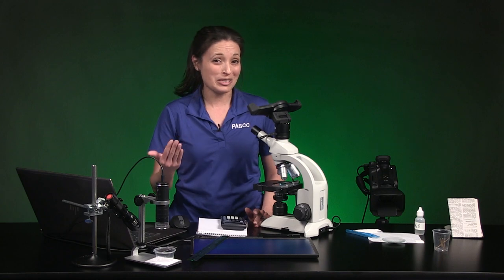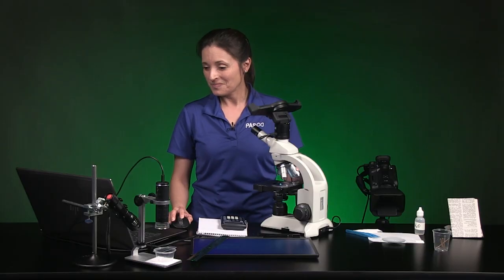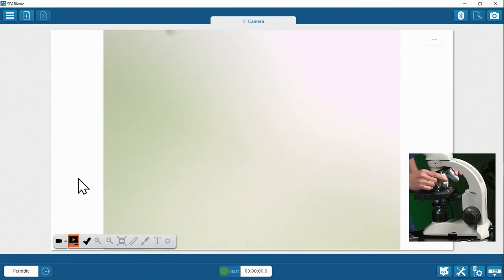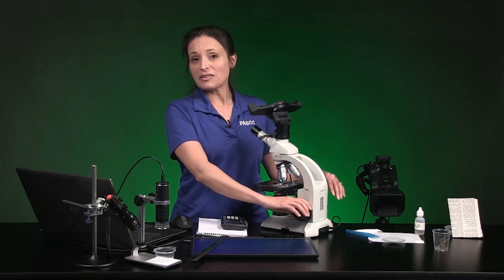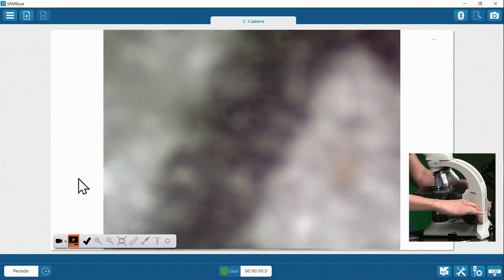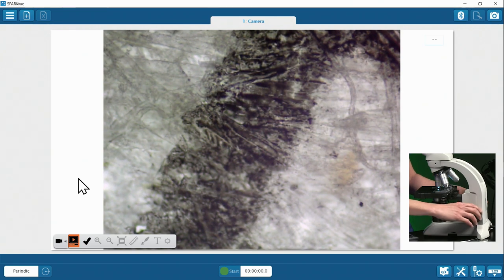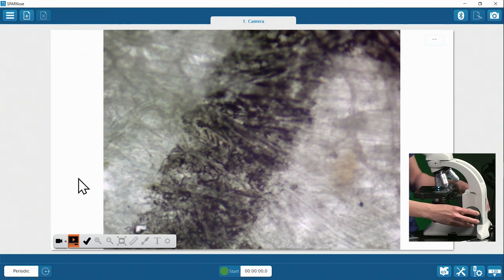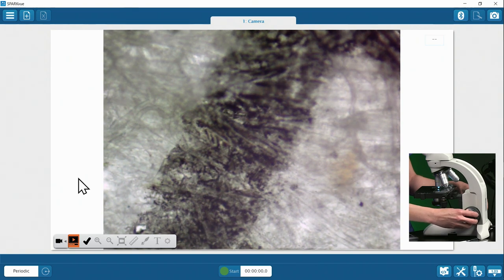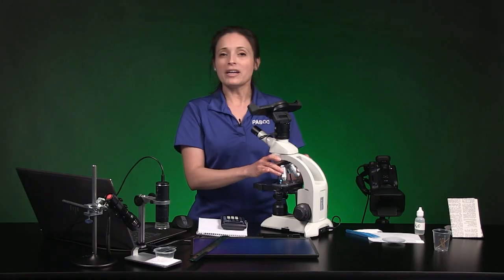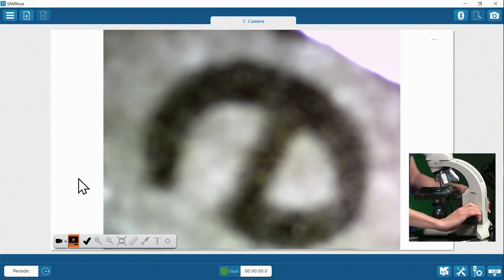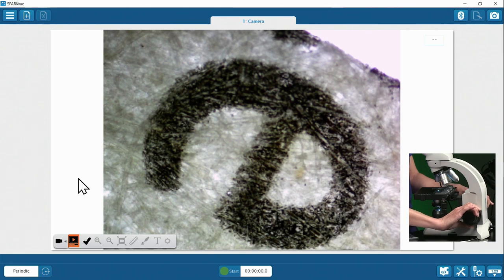I'm curious to see what happens when I change to the next higher objective lens — this will be 10x. Now I've got a live feed. I'm at the 10x objective, so I have to adjust focus and light again for image clarity. I can't see the entire letter E in this view, but it's interesting to see the close-up image. I'm going to go through several levels of fine focus to give you an idea of what it looks like up close, then I'll go back to the 4x objective lens and make the necessary focus adjustments.